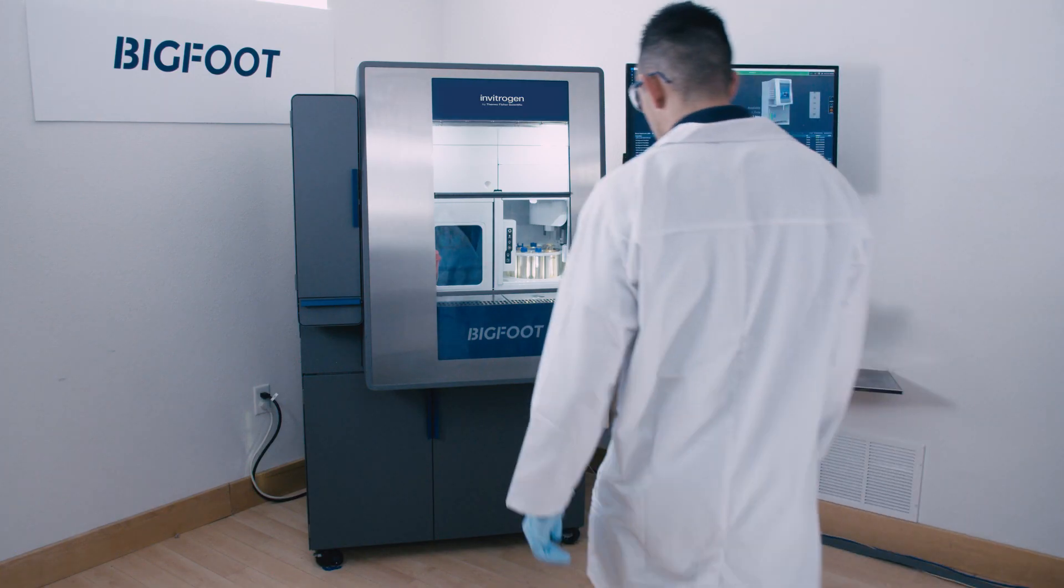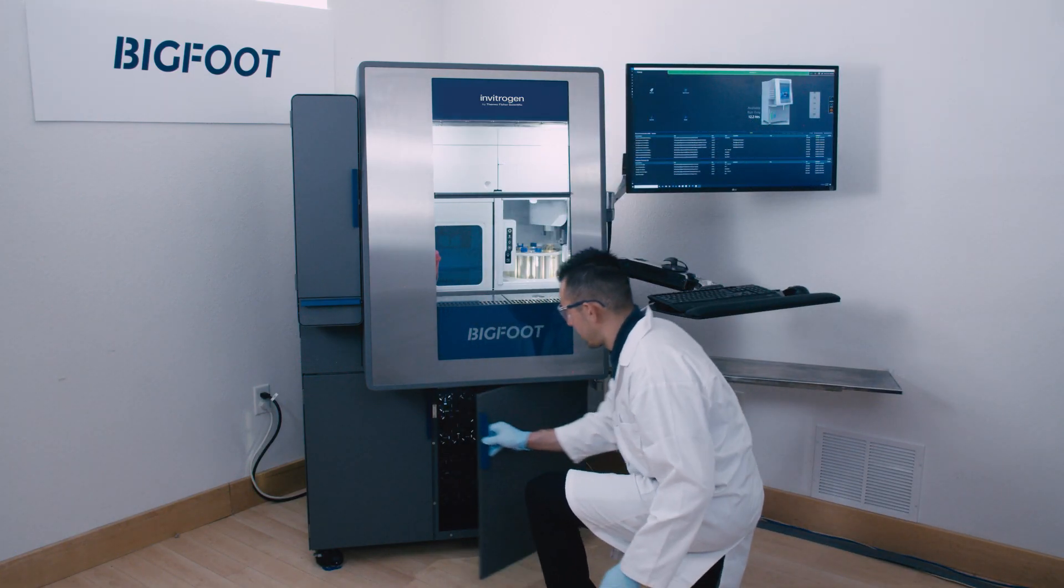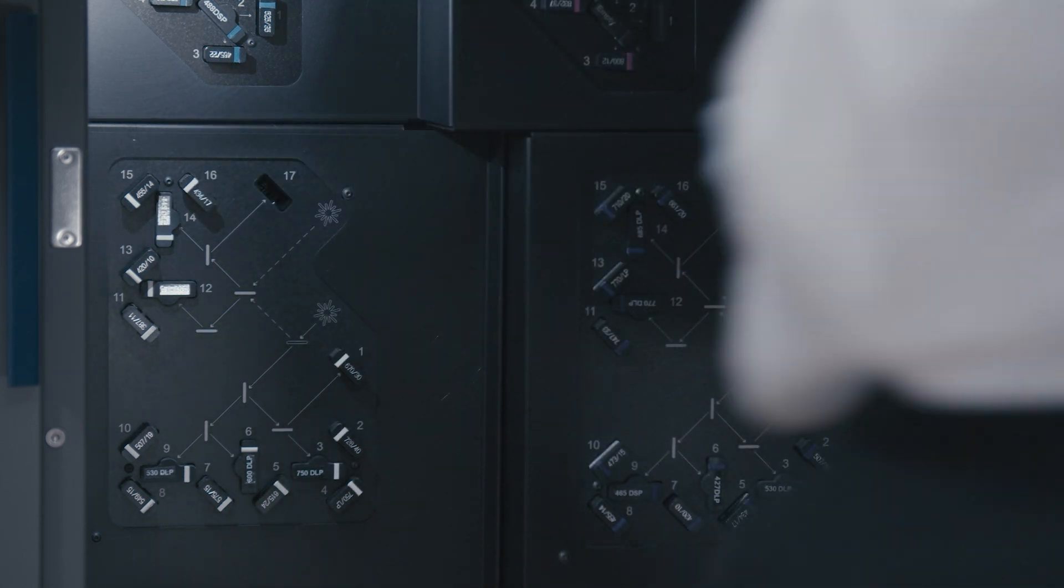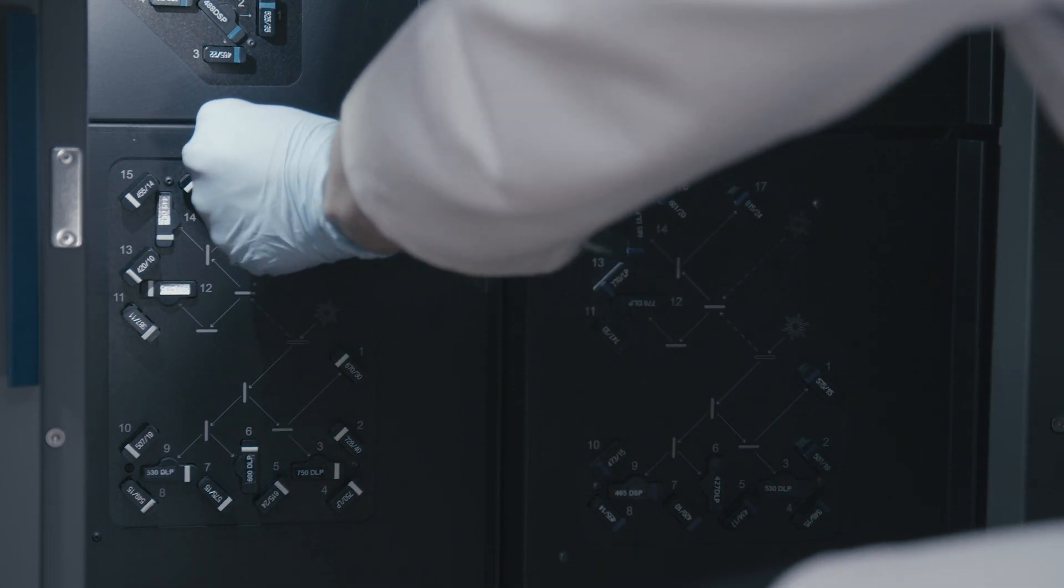The Bigfoot Spectral Cell Sorter can be configured with up to nine lasers and 60 detectors and is capable of sorting using compensation or spectral unmixing.